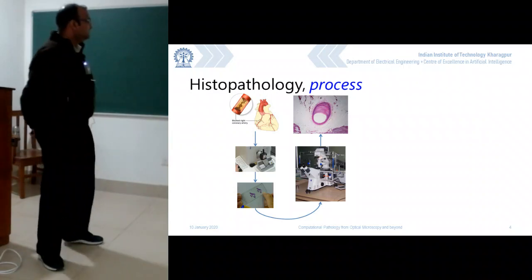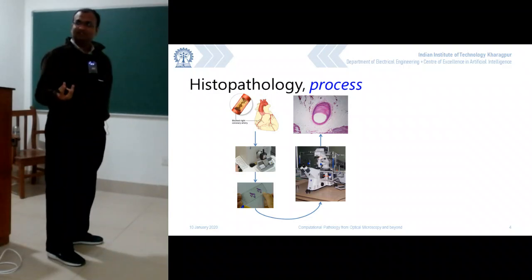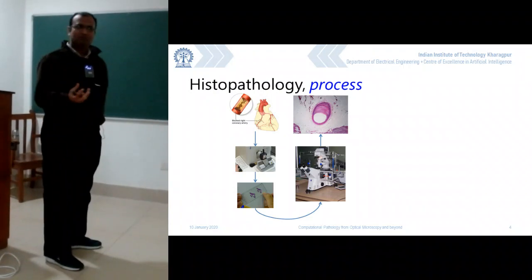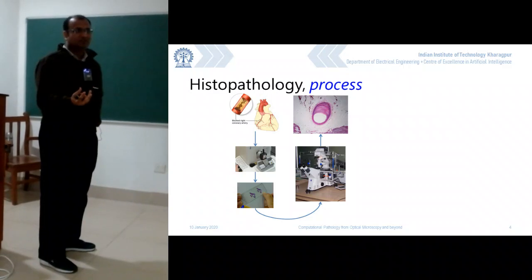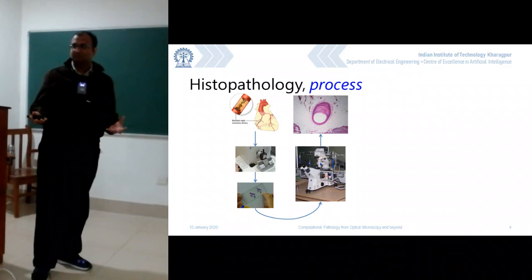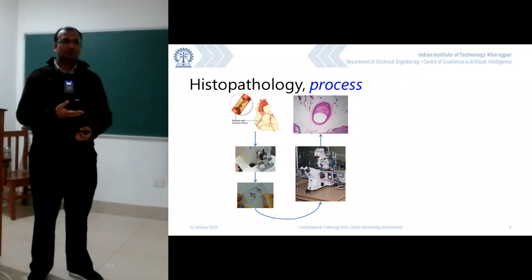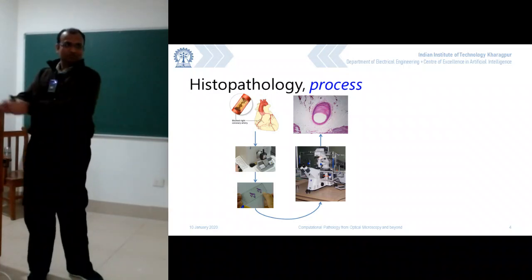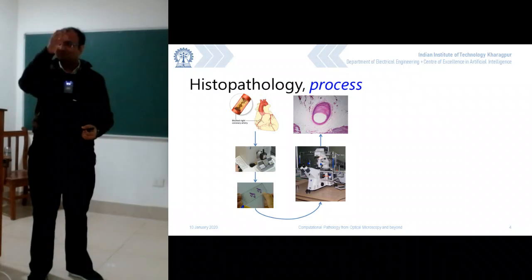Here my whole interest is that what I have inside a microscope is just a white light source, a box which contains a small bulb. These days people use LED bulbs, but earlier we used normal tungsten filament lamps, such that the spectrum is somewhat similar to the spectrum of the sun, the standard daylight. If you did microscopy in school, you might remember you had to take it near the window in the biolab, and there was a small mirror reflecting that light. Generally it was a concave mirror, so that you get a parallel reflection of light coming down.